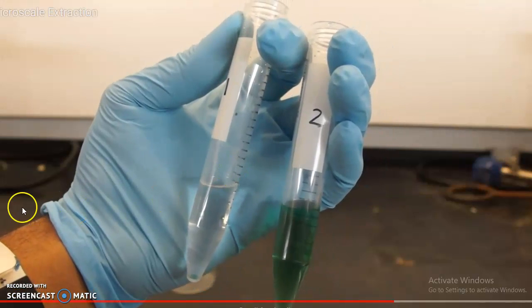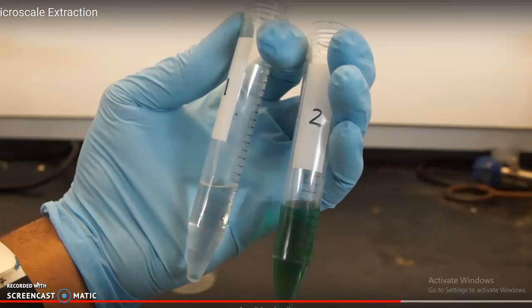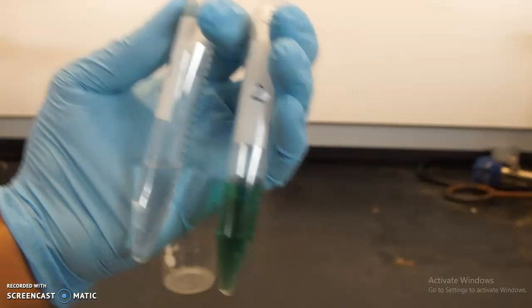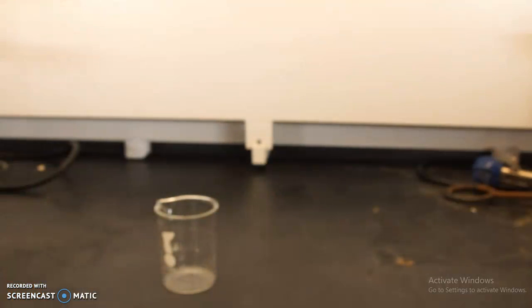At this point, you've completed your first extraction, but there may still be some organic product in your aqueous layer. So, take your aqueous layer and add fresh organic solvent and shake it, vent it, leave it, and extract out the aqueous layer again. You can repeat this a minimum of 2 more times.